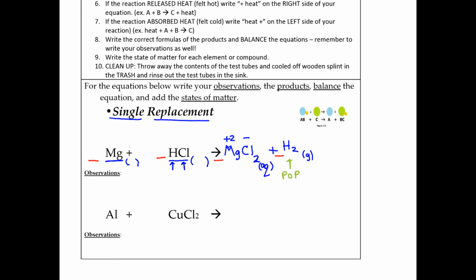And you should have also felt the relative temperature and found out that this felt hot. If it feels hot, that means heat is being released. And this is an exothermic reaction as well. So don't forget to record your observations.